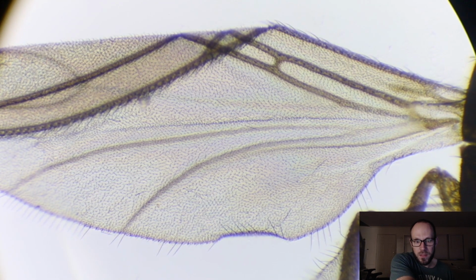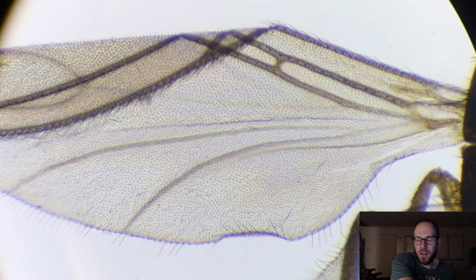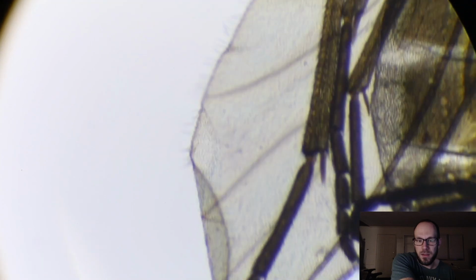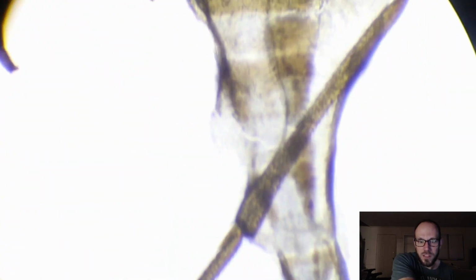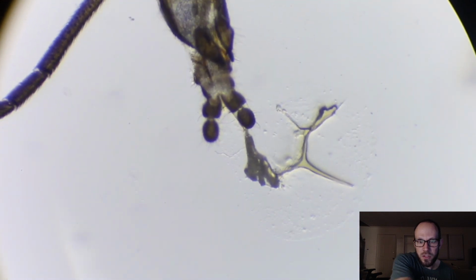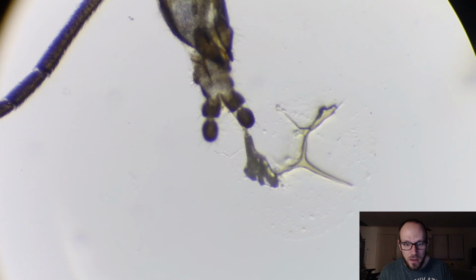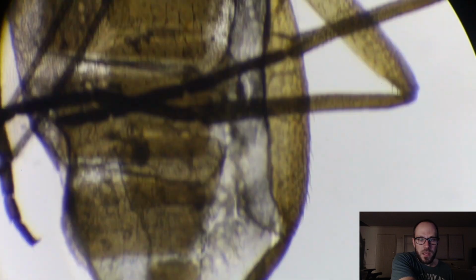These hairs are now 100 times bigger than they actually are, but on your screen, obviously, that's not going to be accurate to life, but it still gives you a sense for just how small this stuff is. And yeah, he definitely shat himself upon dying, as can be seen here. Again, I'm going to show you all this in Darkfield as well.